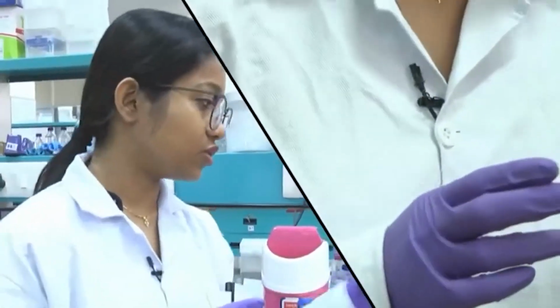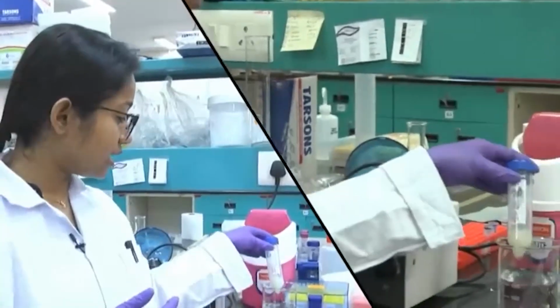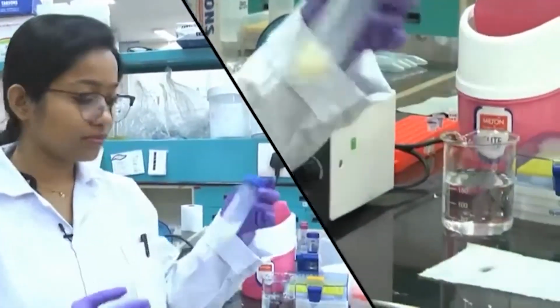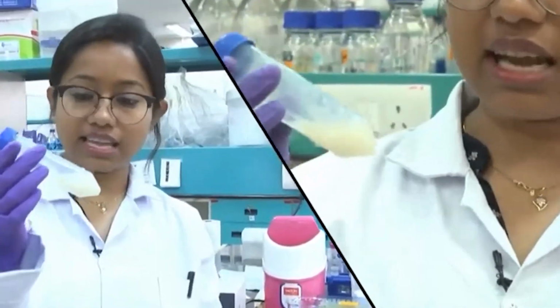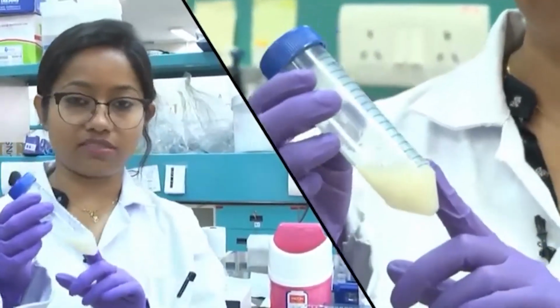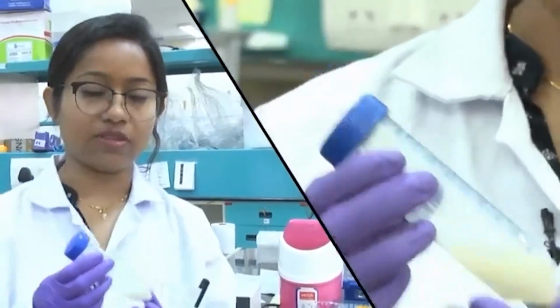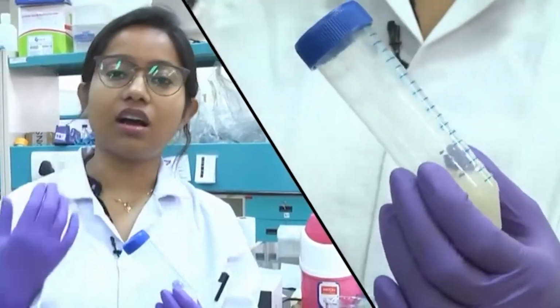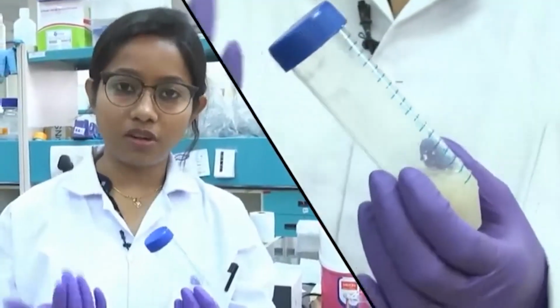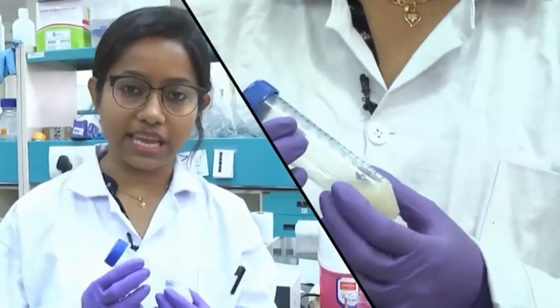Another thing you can do is get the cell pellet and resuspend it in a lysis buffer. Here in this case I have resuspended it in the lysis buffer. It has around 1 liter of culture, and this pellet I have resuspended in lysis buffer. So what does the lysis buffer contain? Lysis buffer contains a buffer system, so obviously it has a particular pH range. In our case it is around 8.